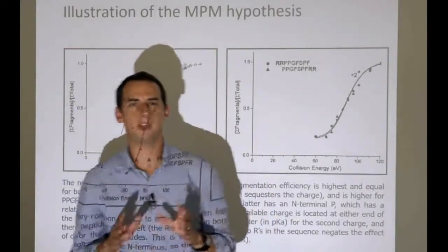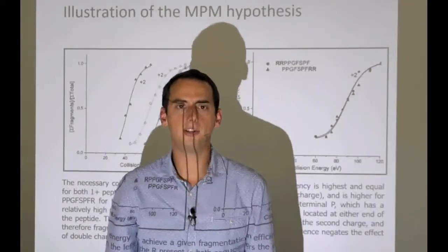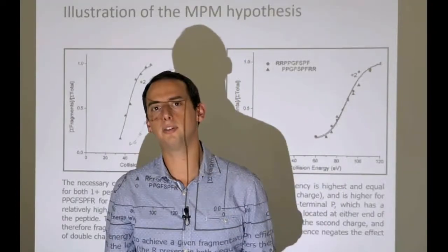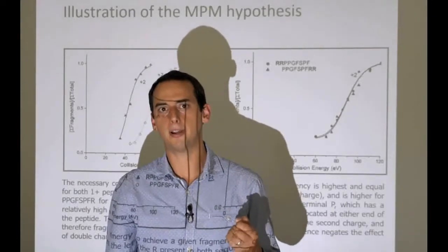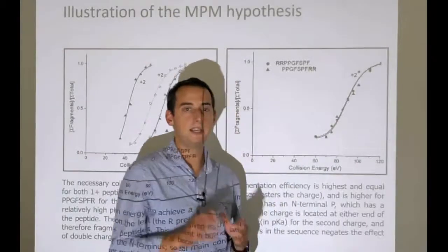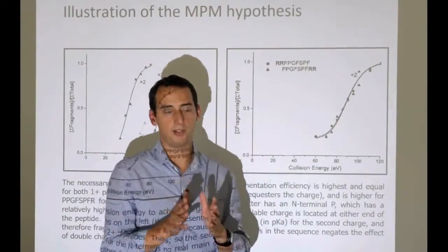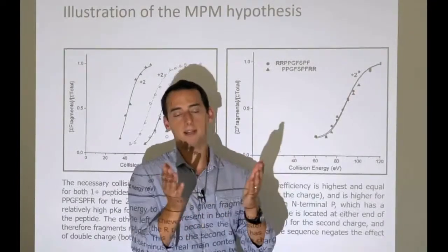Finally, we talked about HCD very briefly at the end of the last lecture. And HCD, this higher energy collisional induced dissociation, is a very special kind of fragmentation when it comes to the kind of fragments we expect. For the simple reason that B ions, which are generated whenever you split a peptide in two, you get a B ion and a Y ion.